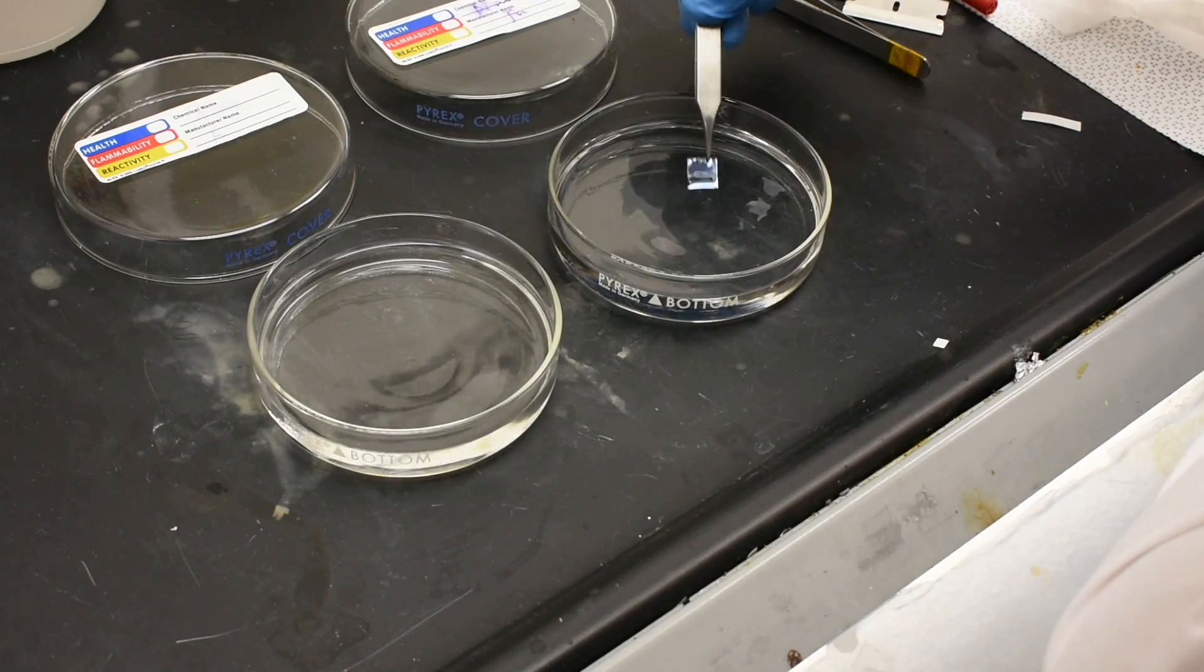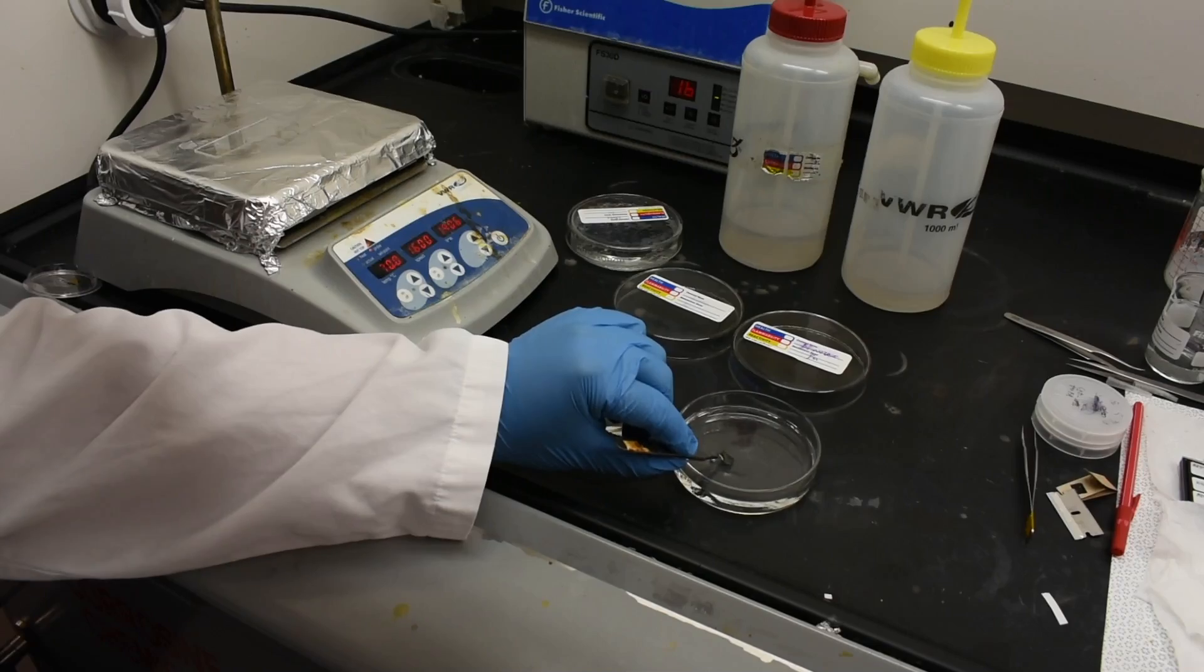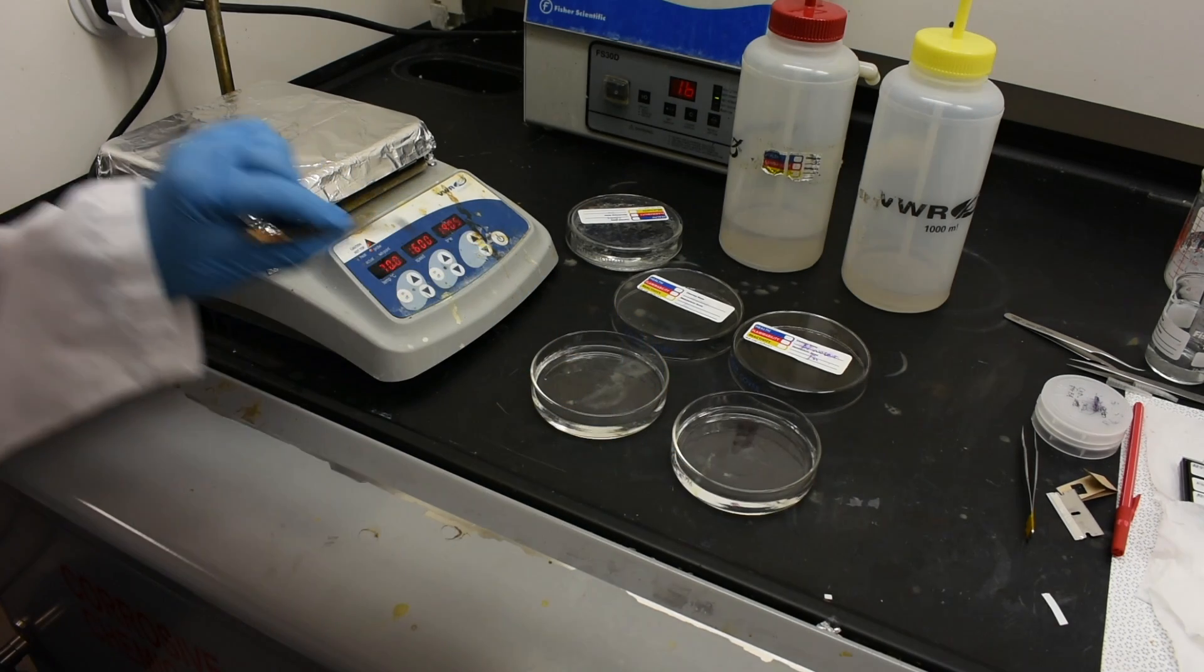After the acetone soak, the samples are rinsed in isopropyl alcohol for 10 minutes, and then dried on a hot plate at 70 degrees C for 5 minutes.